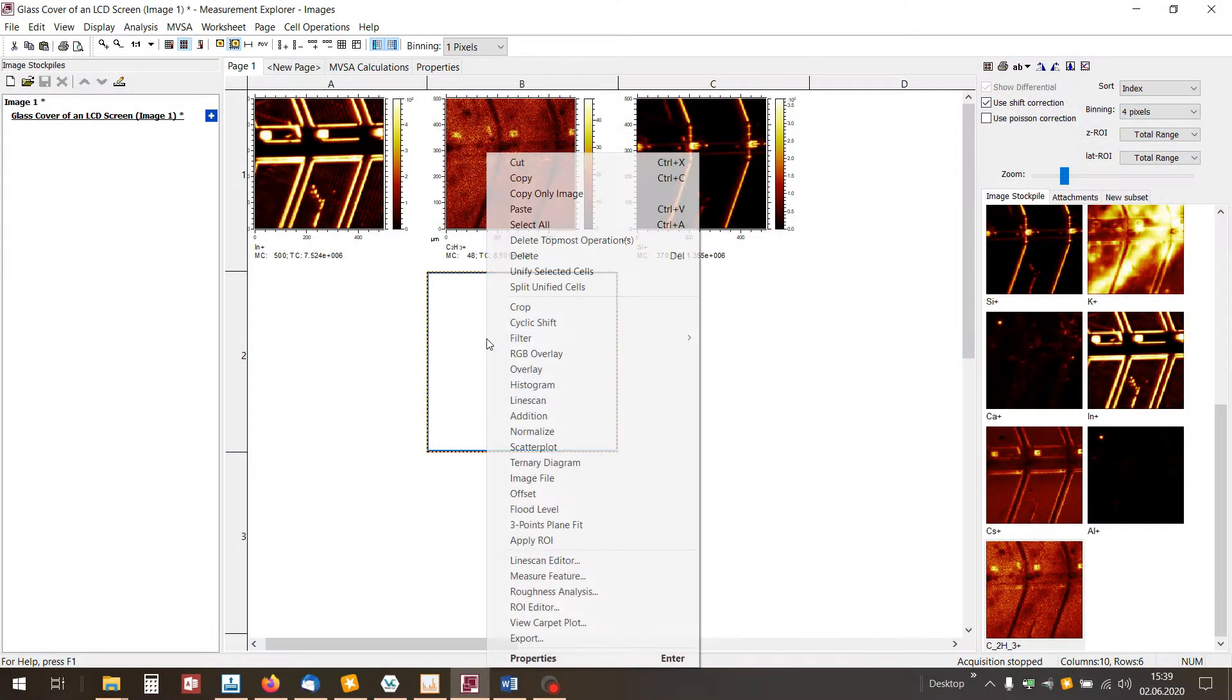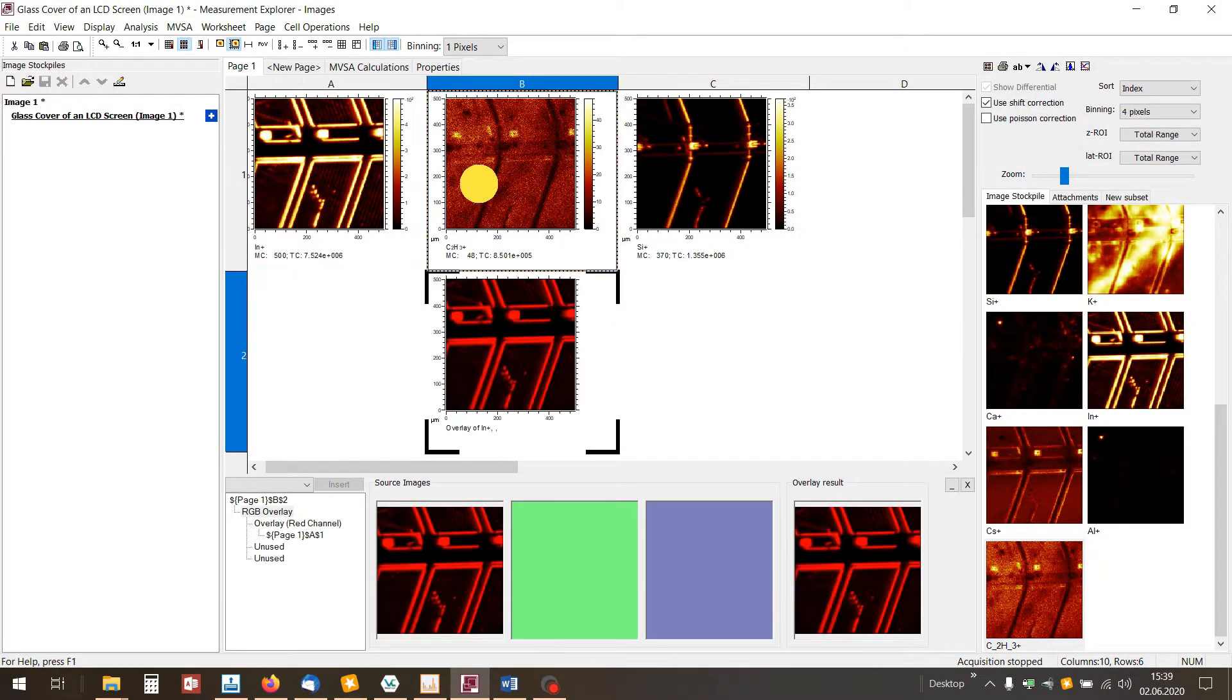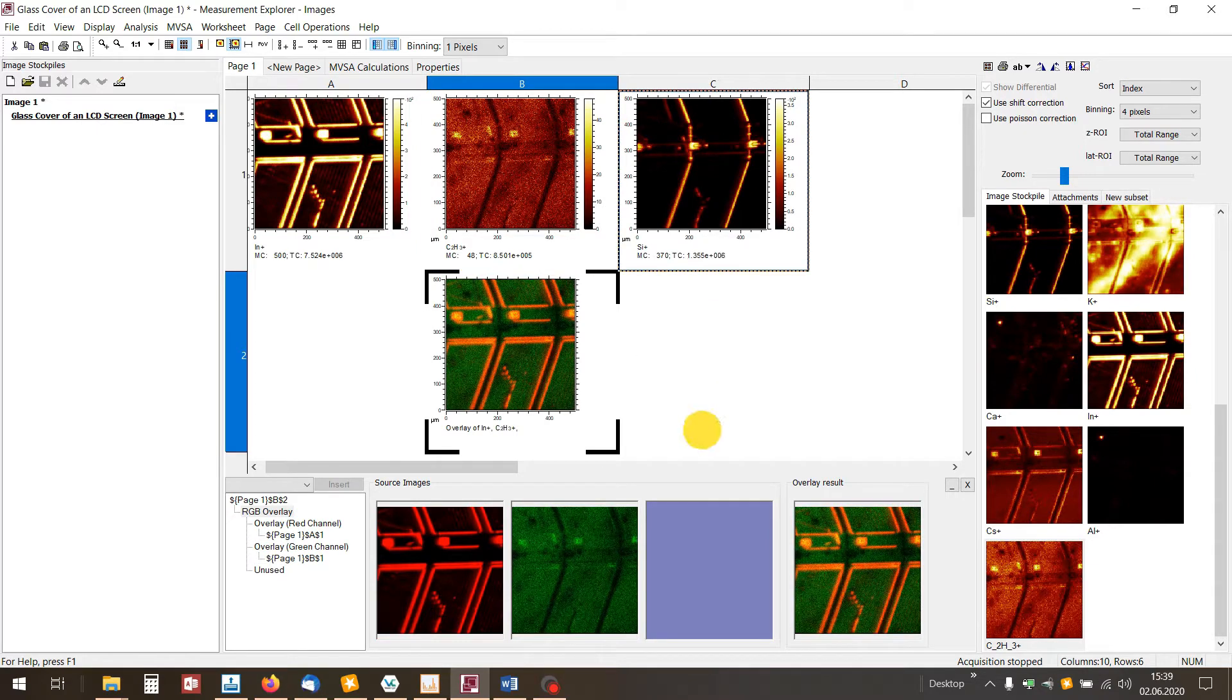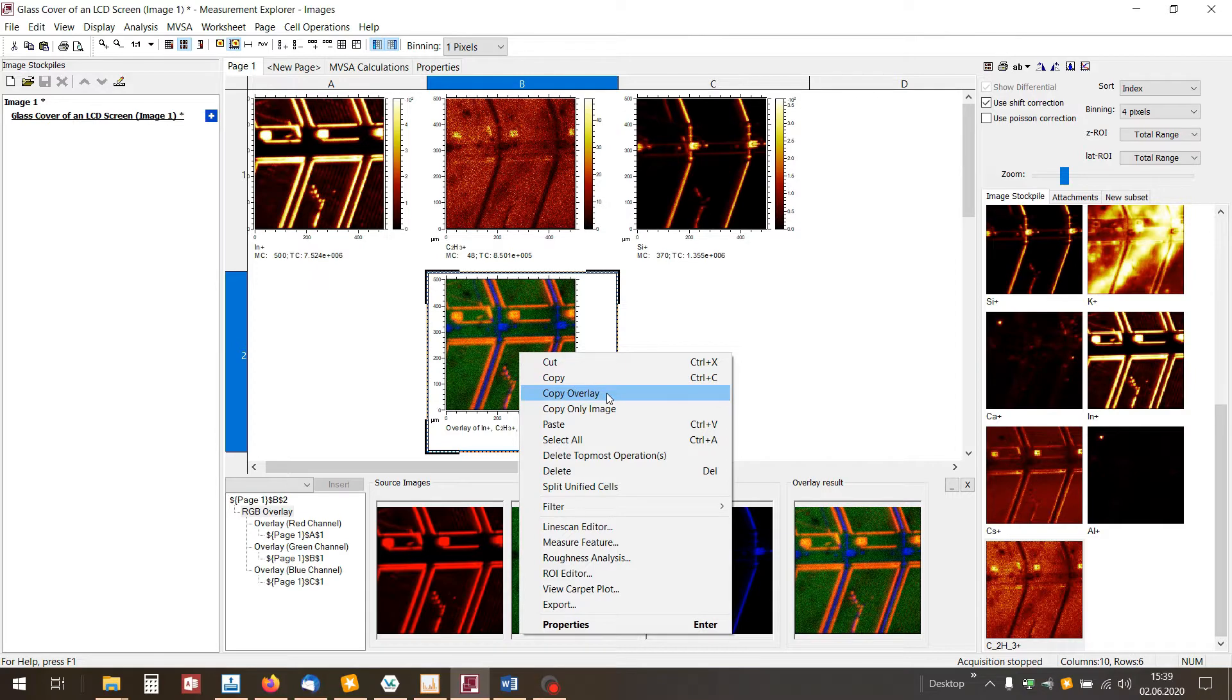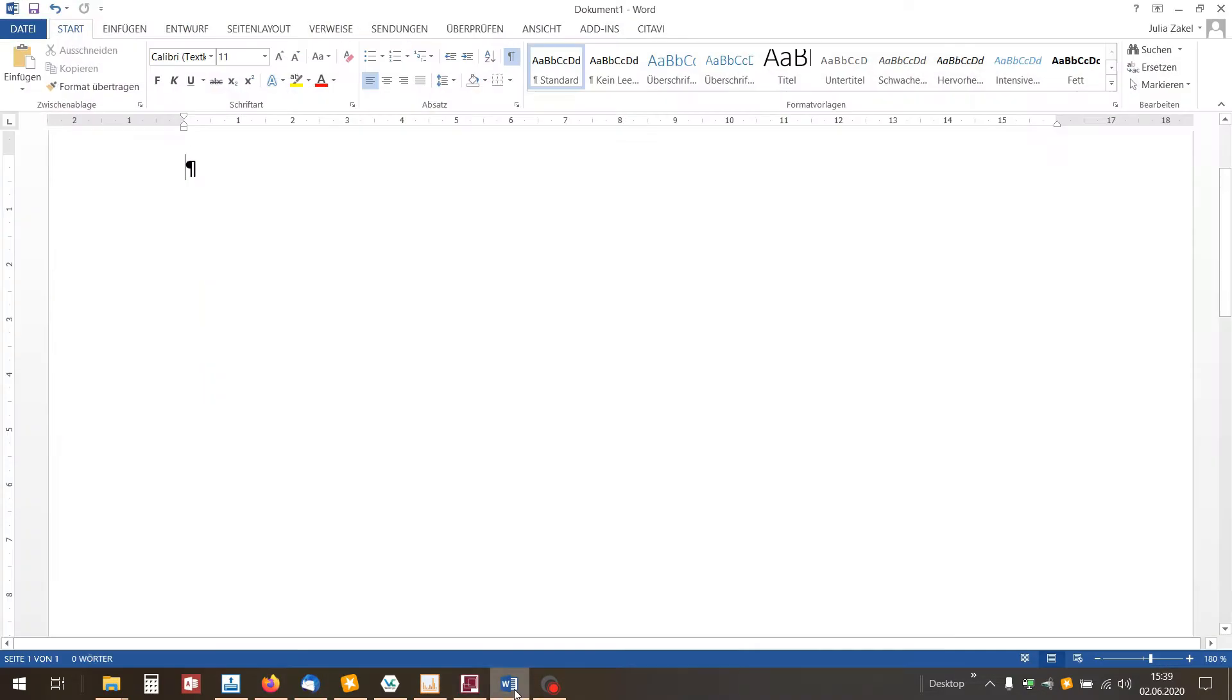Let's start with the RGB overlay. Did you know when you open the context menu with the right mouse click you can select Copy Overlay and paste it into your report? The software automatically adds the three colored channels of the overlay.